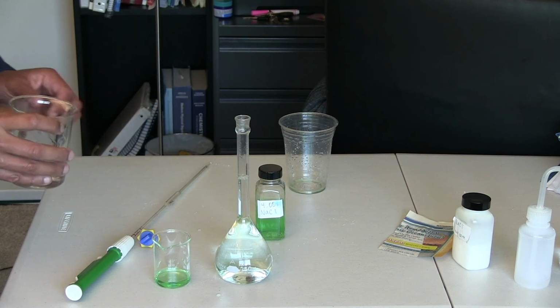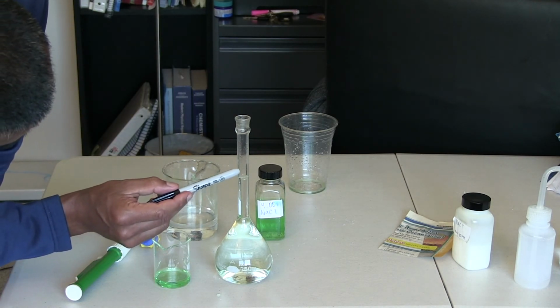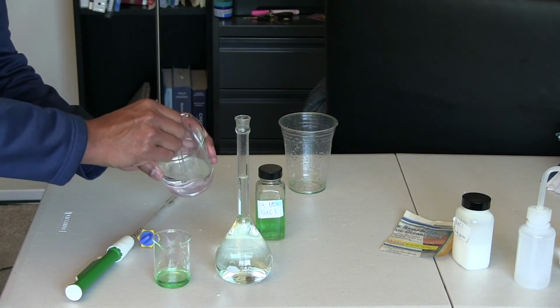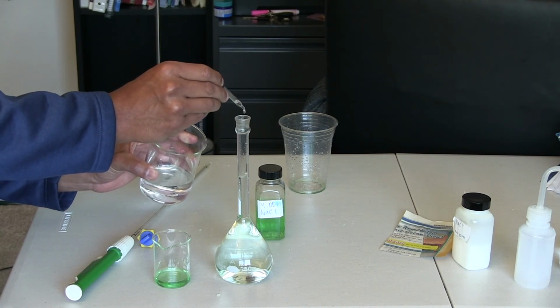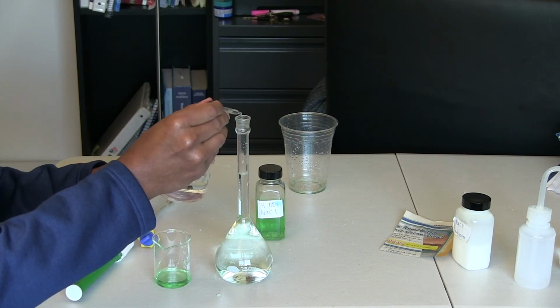Okay, so I added some water and it's close to the mark. The mark is all the way here, about there. At this point, I want to switch to using a medicine dropper, and I want to add drop by drop like this. It's very important you're at eye level so you can see where the meniscus touches the mark.